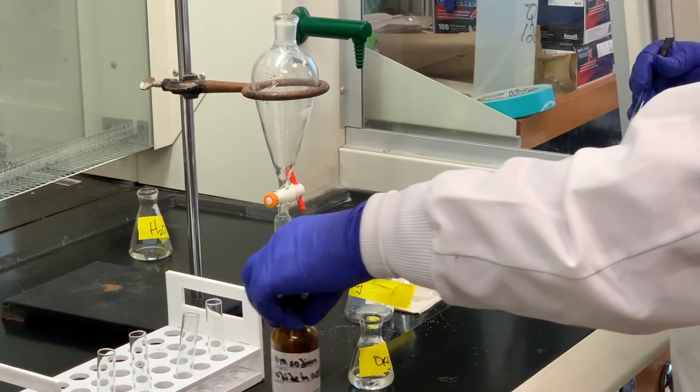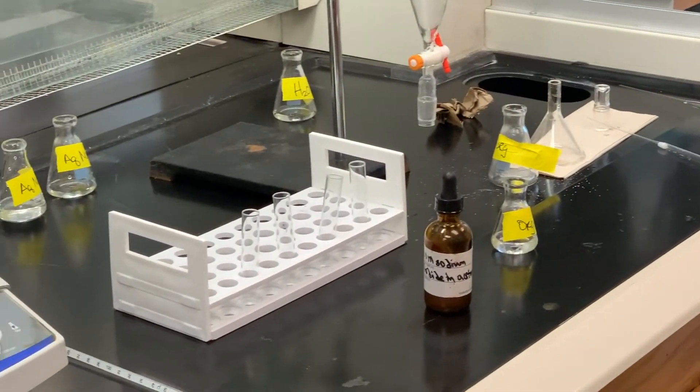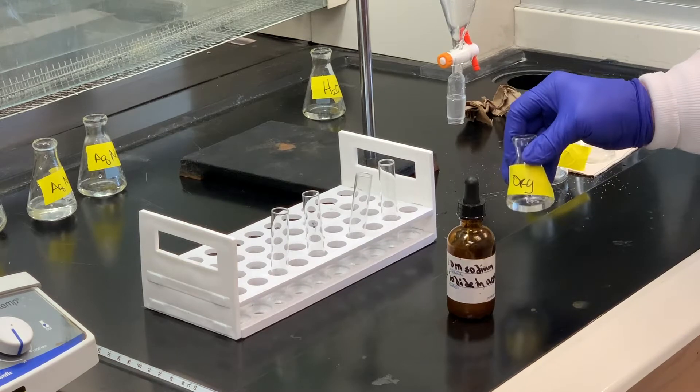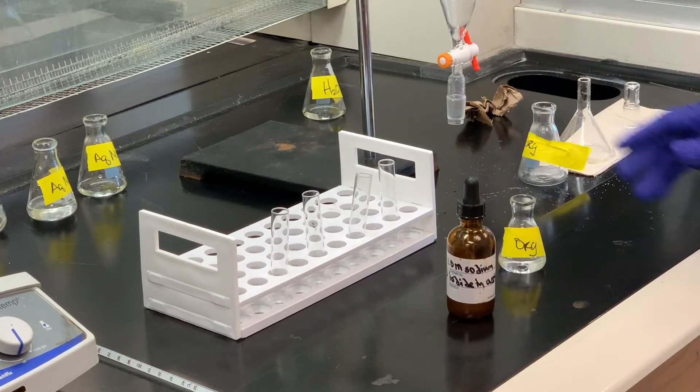One of these tests is called the sodium iodide acetone test, and what that particular test does is identify what type of alkyl halide you have — do you have primary, secondary, or tertiary? Basically, we'll take some of this reagent, place it into a test tube, add a couple drops of our organic product, and we're looking for a precipitate or not depending on what classification we have.